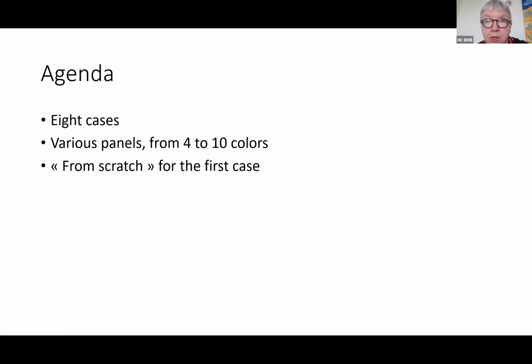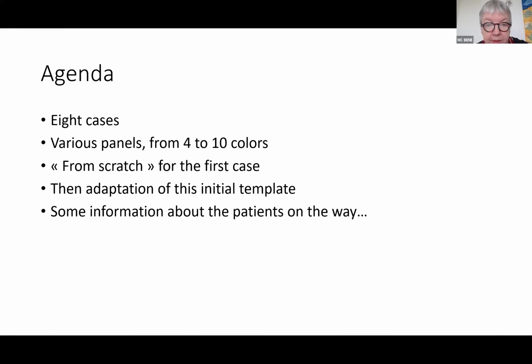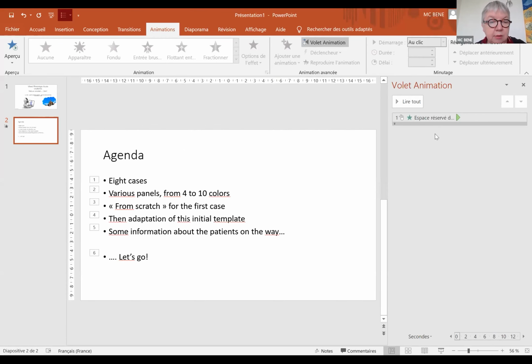We will start from scratch for the first case, although you know that I would just like to show it in case some of you are not so familiar with the template or protocol creation. Then we will adapt from these initial templates, and I will give you some information about the patients as we go. So let's go. Don't be afraid by the list that is on the left. We're going to go through that properly. So we start with the first case.